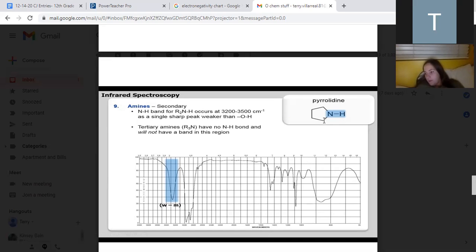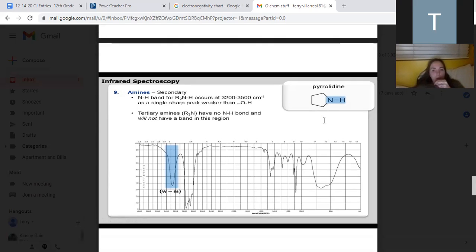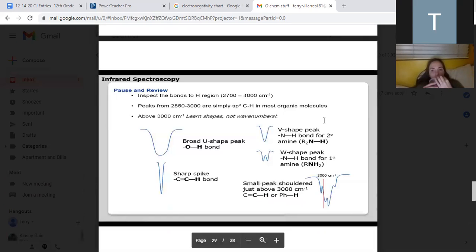When you're looking at an IR, you should never spend more than a minute on it. Get everything you can from it as quickly as you can. Things like an alcohol, things like an amine, and some other functional groups pop very clearly. And here are the terms you need to see. This is just some basic terminology, and as you practice, you'll get better at it.